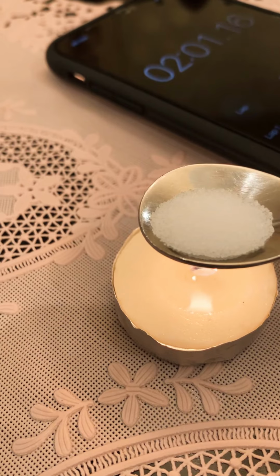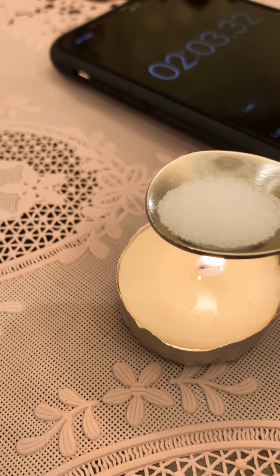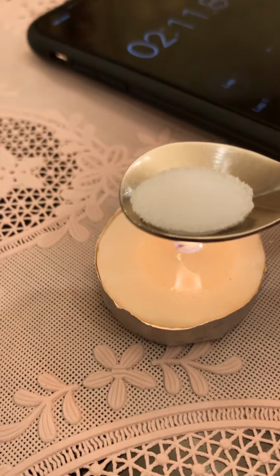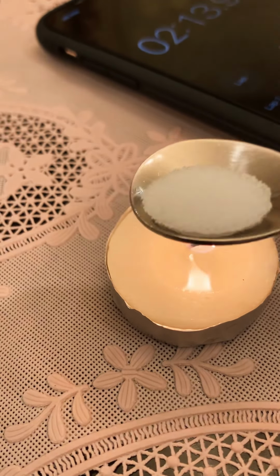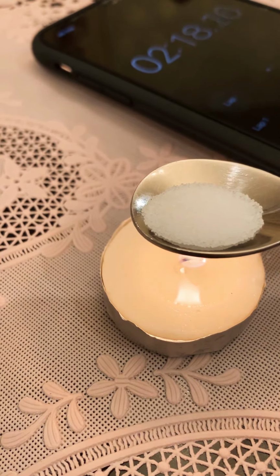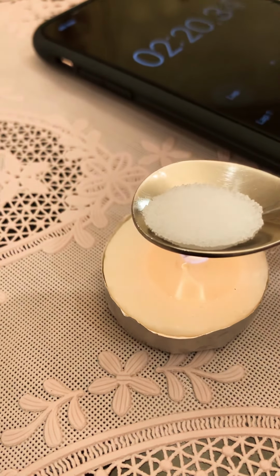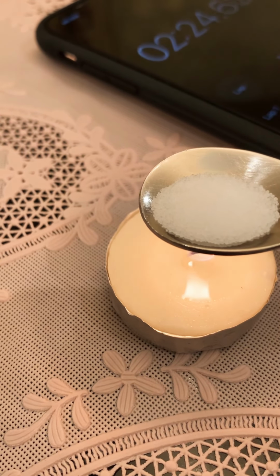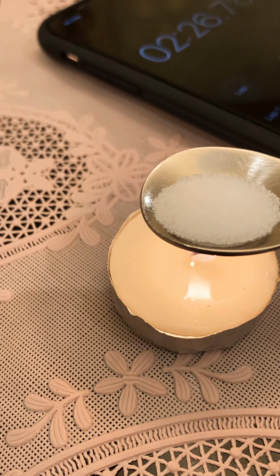As you can see here, we already passed the sugar's melting point. By this time, the sugar has already melted. You can see how the sugar has melted, and if you look at the salt, it's the same. Nothing happened. We're going to try to stay like that for 5 minutes, and after 5 minutes, we're going to come back.